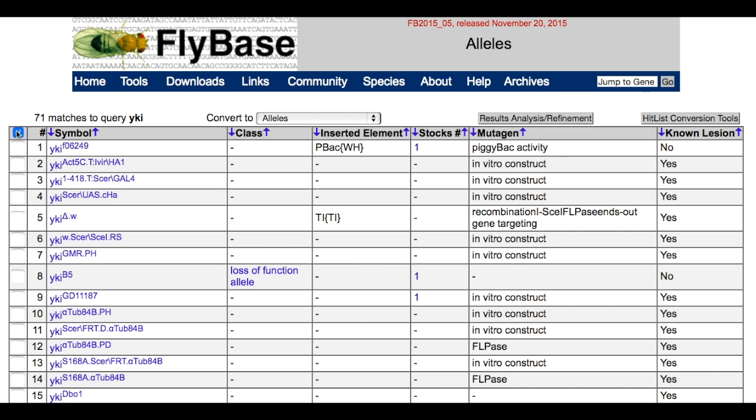To unselect all alleles, click the box at the top. You can then select the alleles one by one. To re-select them all, press the box at the top again.